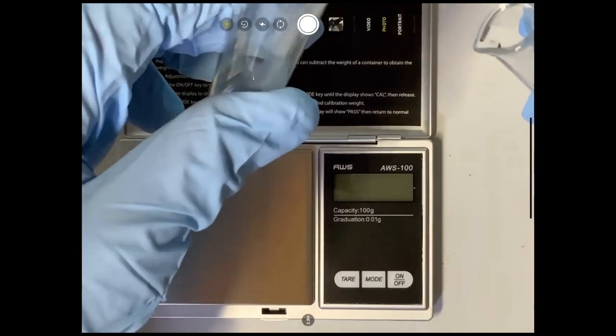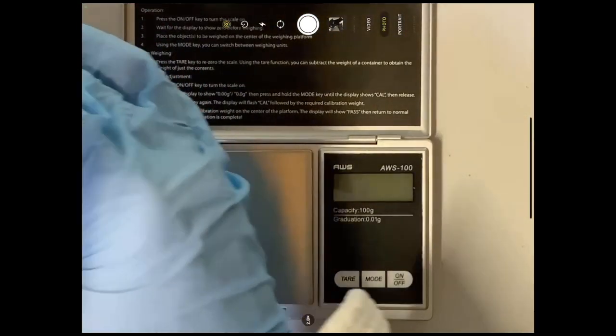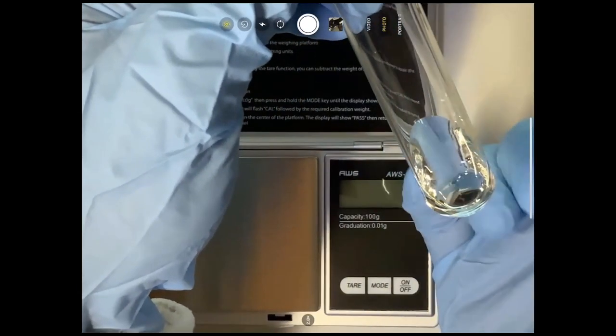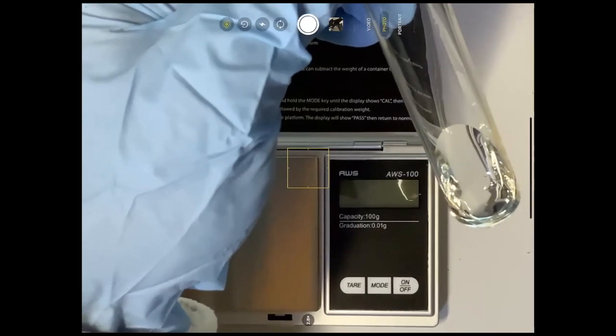And then what I should have is, if I did this right, you should be able to see, and I don't know if you can see this. Yeah, you probably cannot, because I can't tip this over. But there's two liquids that are separated and they're both transparent, okay?